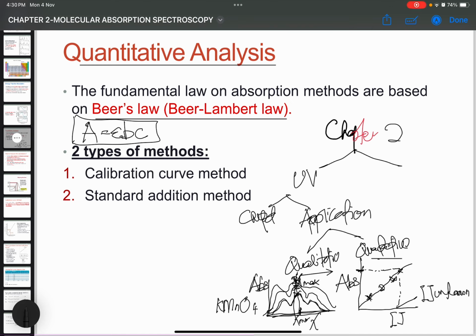So how does the instrument measure the absorbance? We must always work at the wavelength of maximum absorbance, lambda max lah tadi ni. This is the point where it has the maximum response, due to better sensitivity and lower detection limit. We also can reduce error in our measurement when we perform the analysis at lambda max.